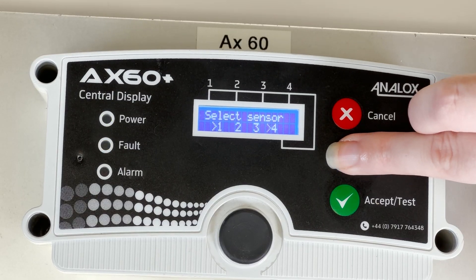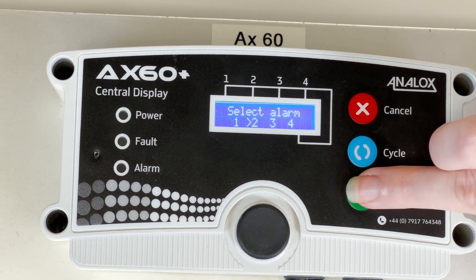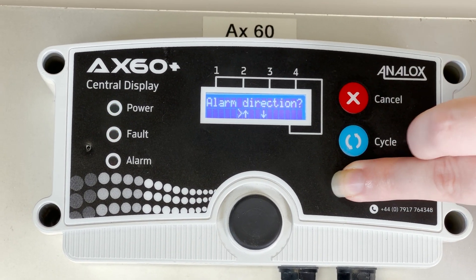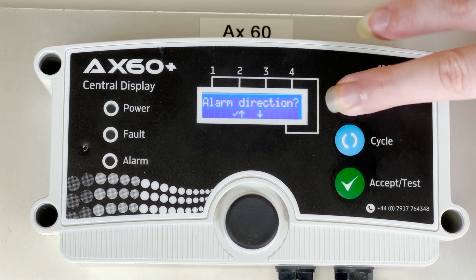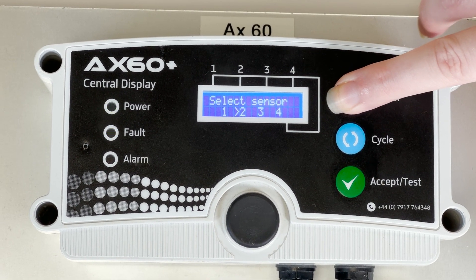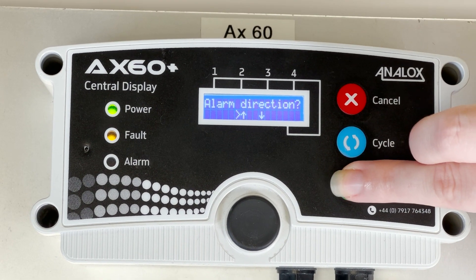From here you can select the sensor that has been alarming, which is shown on the display. Press cycle until the relevant arrow and the relevant sensor is selected. In this case it's the CO2 sensor, which is sensor 2. Therefore the alarm direction should be up. Press accept to select it and change the arrow direction to up, and then press accept again. This tells the unit that the alarm is set to go off when it goes above the alarm set points.